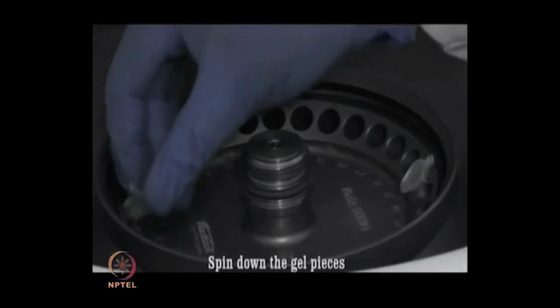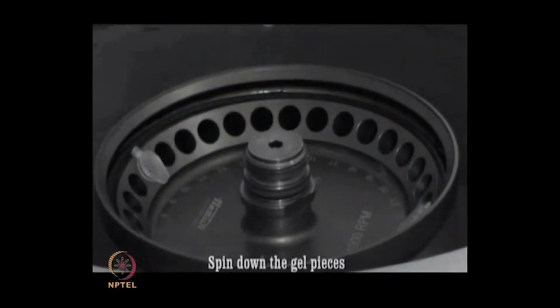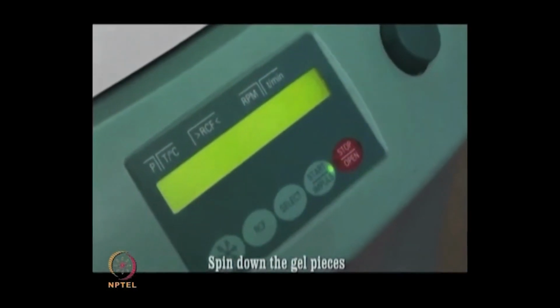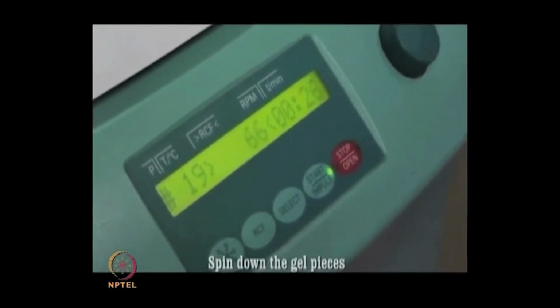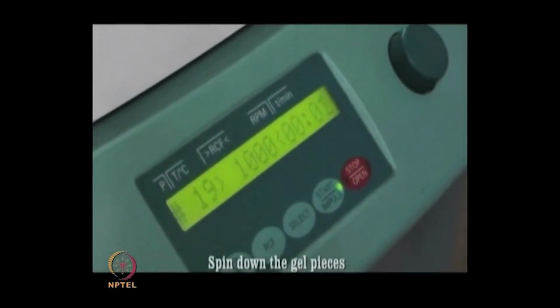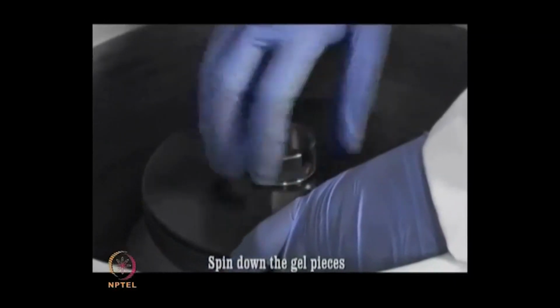Now, spin the gel pieces down at 1000 g for 30 seconds. Once centrifugation is complete, then remove all the liquid.